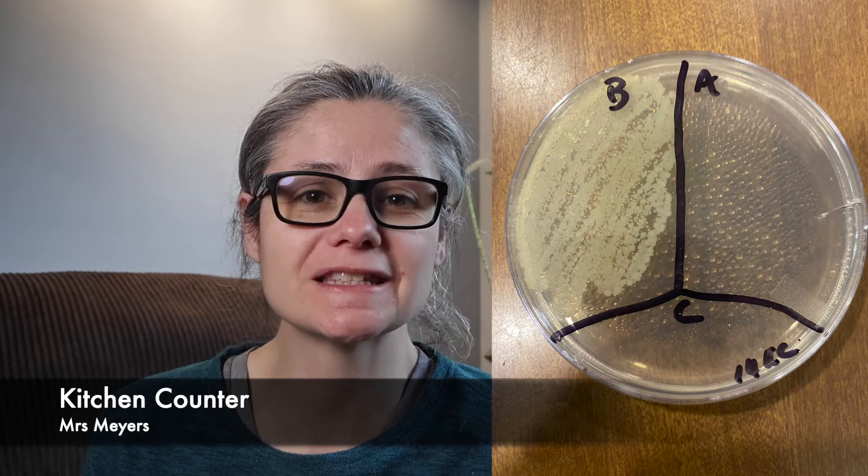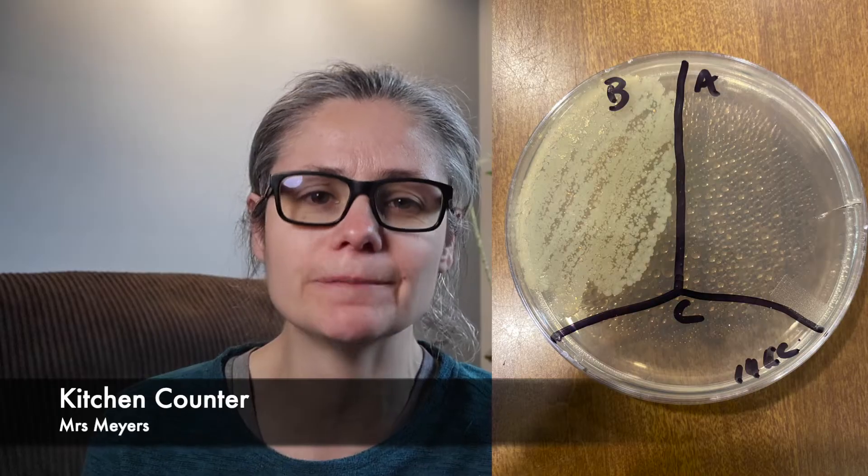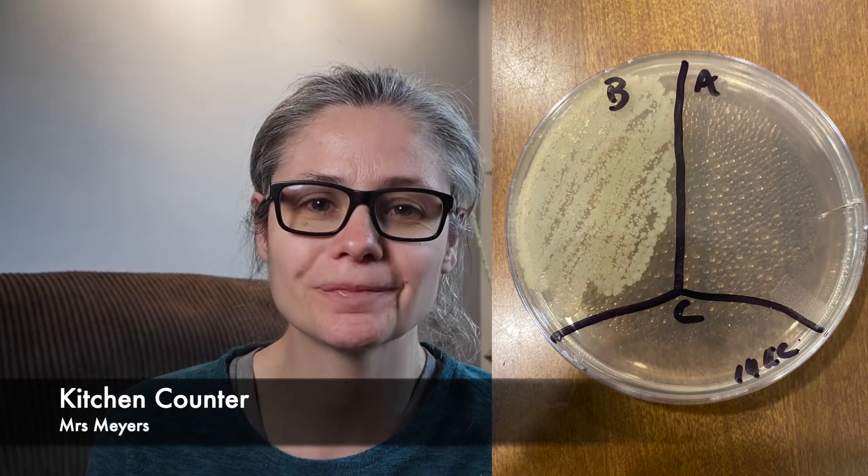Now for some results. The kitchen counter. In the before section, we can see a lot of bacteria there. And in the after section, there are a few tiny bacterial colonies. So Mrs. Meyers does an excellent job at removing bacteria from my kitchen counter.